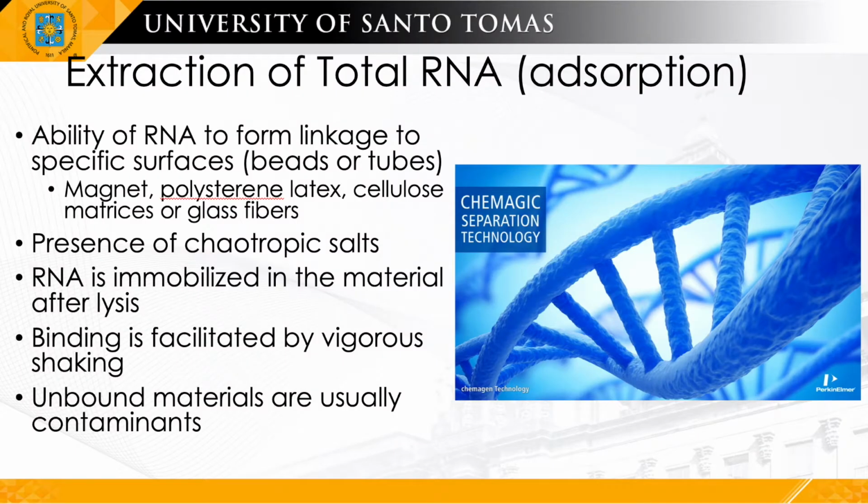The method of extraction of total RNA is an adsorption technique, no? So in this, we utilize the ability of RNA to form linkages to specific surfaces like beads or tubes like magnet, polystyrene, latex, cellulose, matrices, or glass fibers. And to date, this technique is the most commonly employed in commercially available RNA isolation kits.